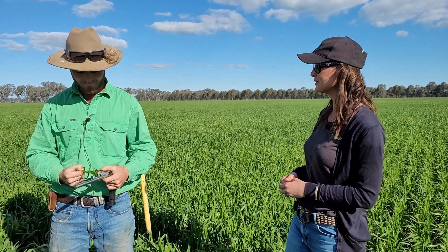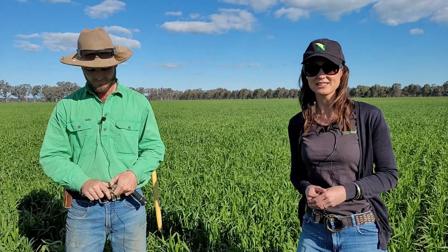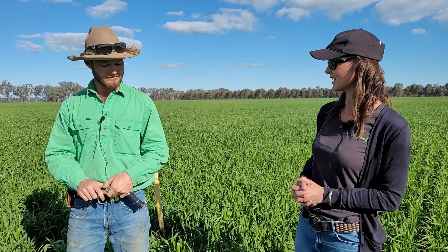Hi, today we're here with Tom near Rutherglen. We're in his wheat crop at booting stage and we would like to do a brix test. The reason we want to do a brix test is because we would like to see how well the crop is photosynthesizing, and see if that calcium is cycling. The refractometer is a great tool to do that.